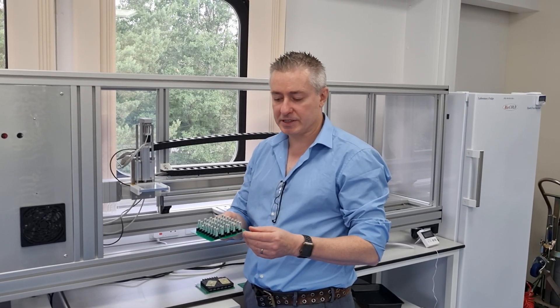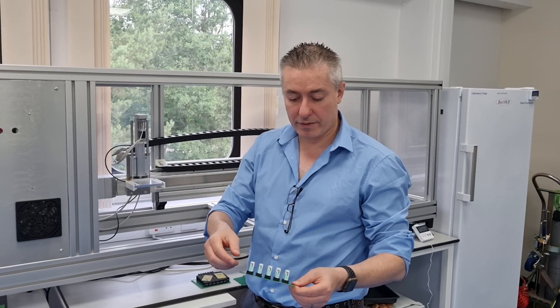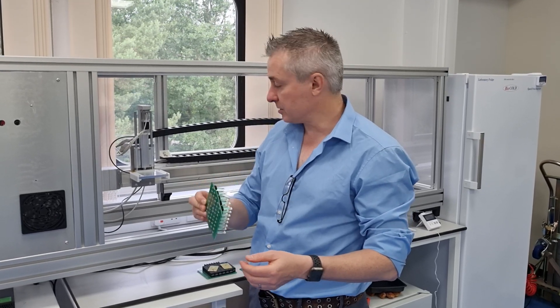What I'm showing here is a PCB board that has been populated with about 40 or 50 screen-printed electrodes.